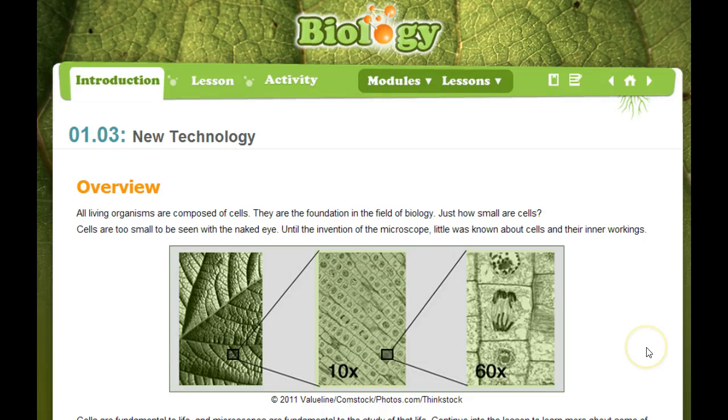Hi students, this is biology lesson 1.03 called New Technology. It's really about microscopes, the different types of microscopes, how we use them, and when we use them.